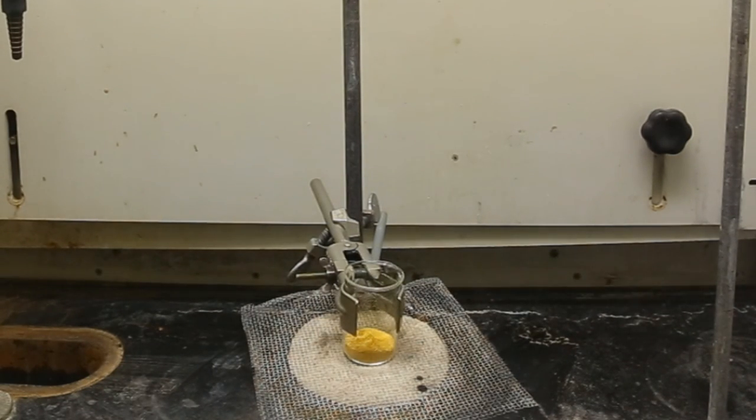About 5 grams of P-Nitroaniline was placed in a beaker, and then a few drops of sulfuric acid were dripped inside. The P-Nitroaniline was then heated until boiling using a Bunsen burner. At this point, I'll just take a minute or so to talk about the reaction in general.